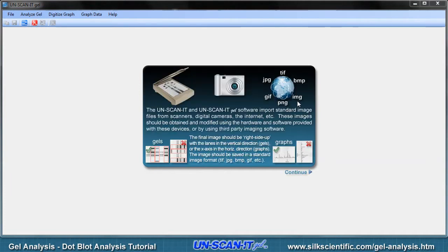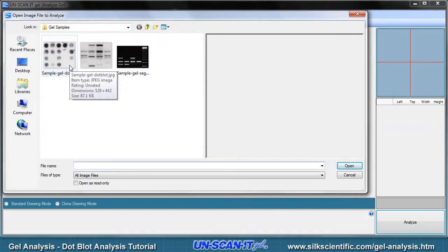The dot blot image can be in a variety of image formats including TIFF, JPEG, Bitmap, GIF, and PNG formats. The image can come from a scanner, digital camera, imager, internet, or other image source. For this tutorial, we will choose a sample JPEG image from a scanner.